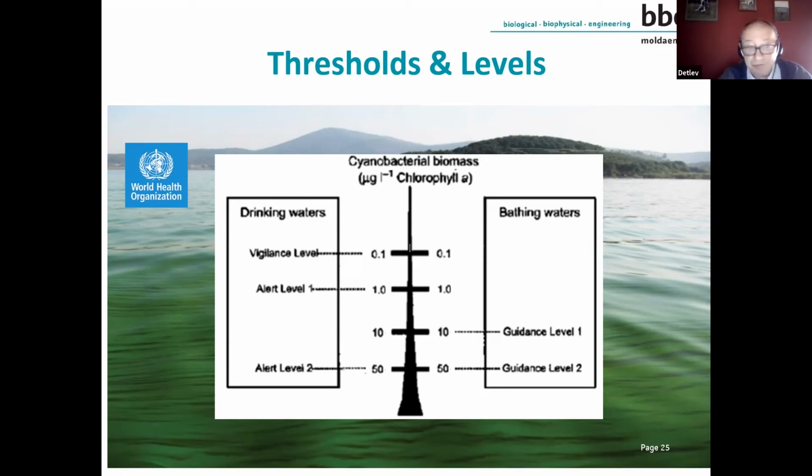Sometimes you have bigger cells, sometimes smaller cells with different chlorophyll contents, or, as I've shown you before, you have these filaments, which are not that easy to count, or if you have, for example, colonies, then it's also very difficult to determine the exact amount of cell numbers. So you see, that is just an idea.